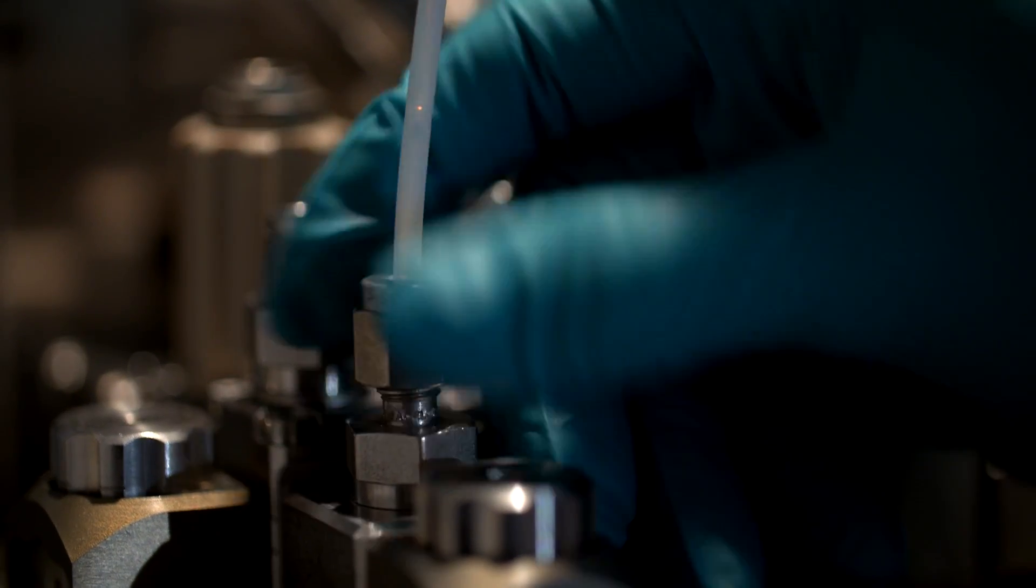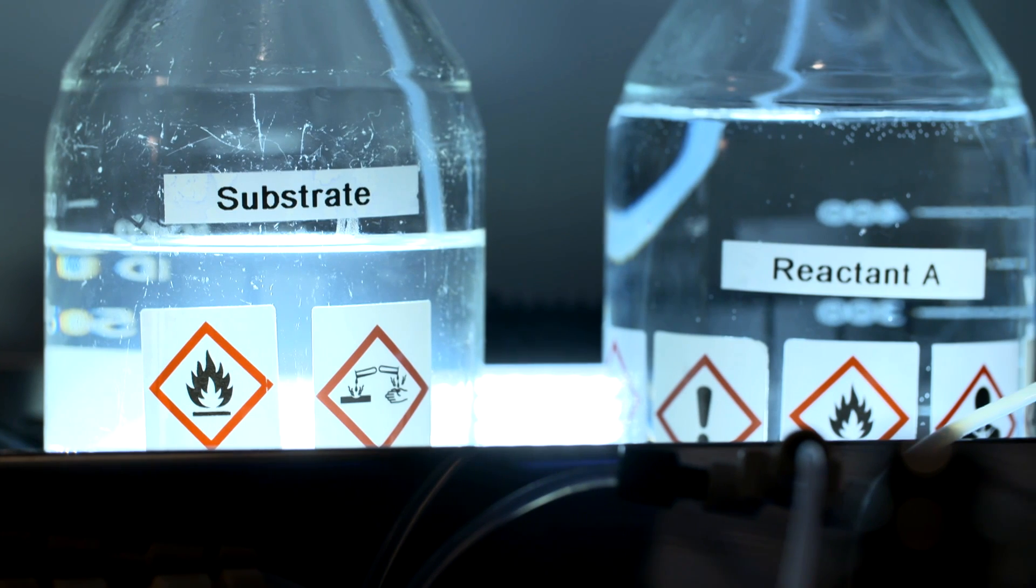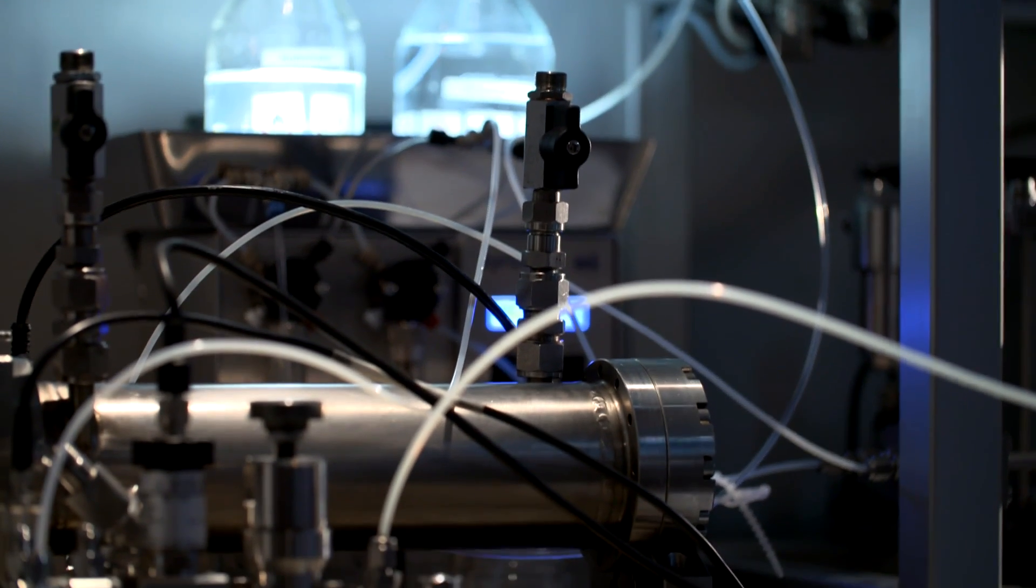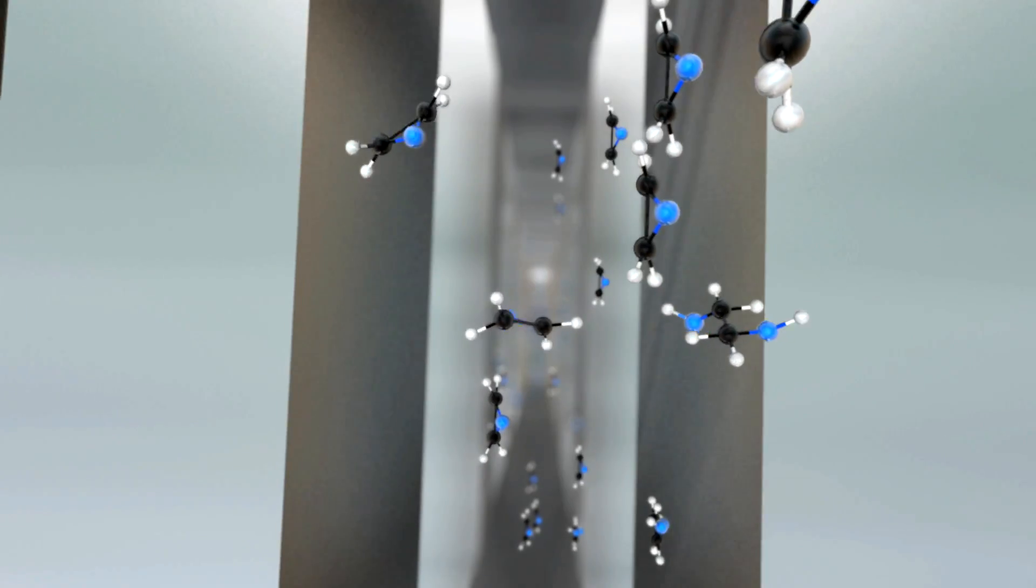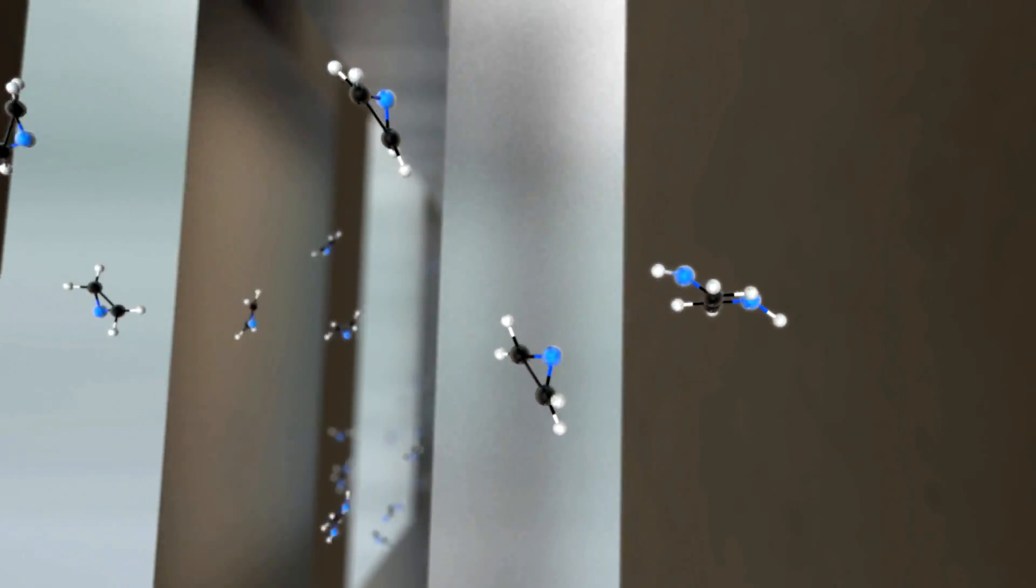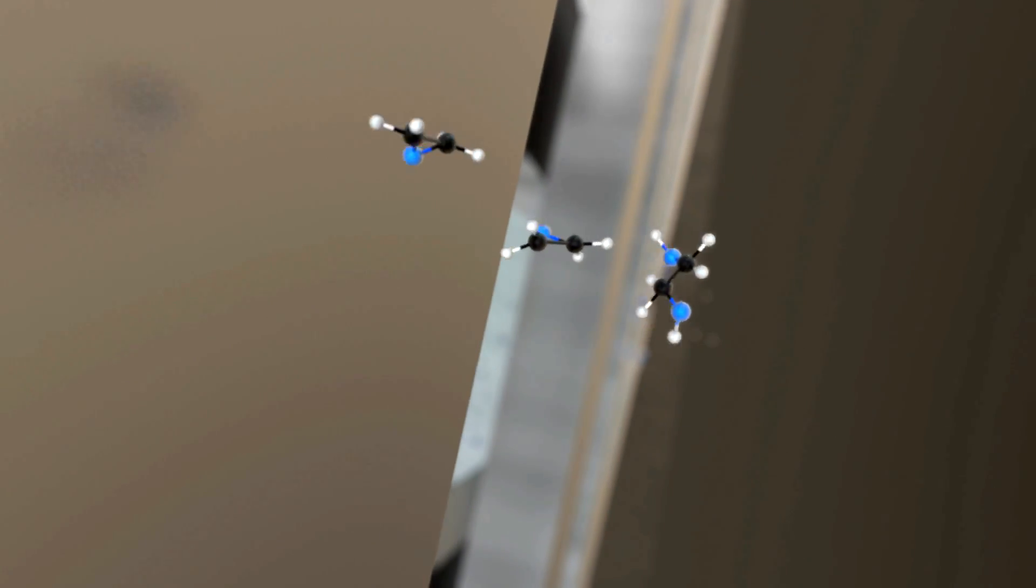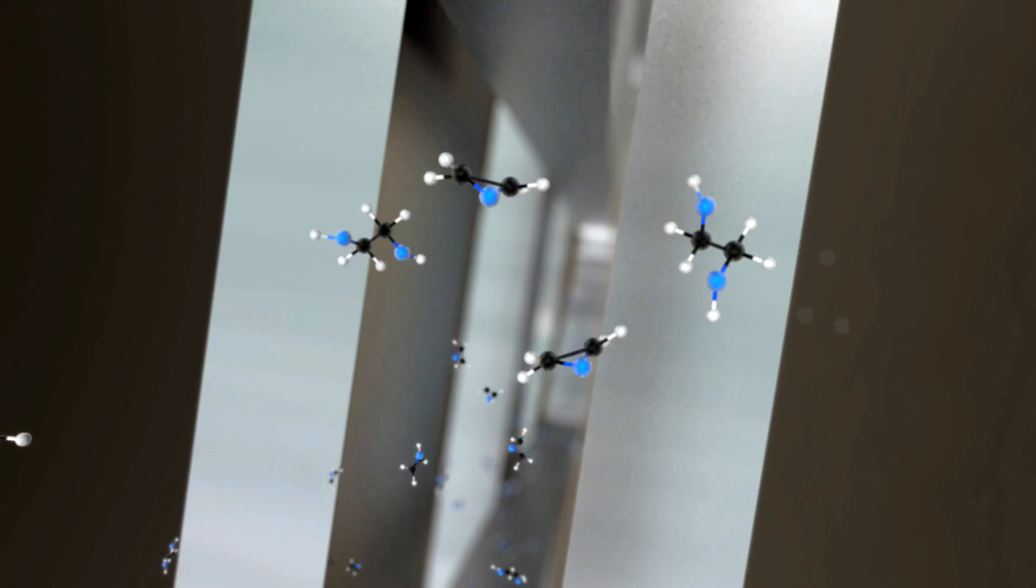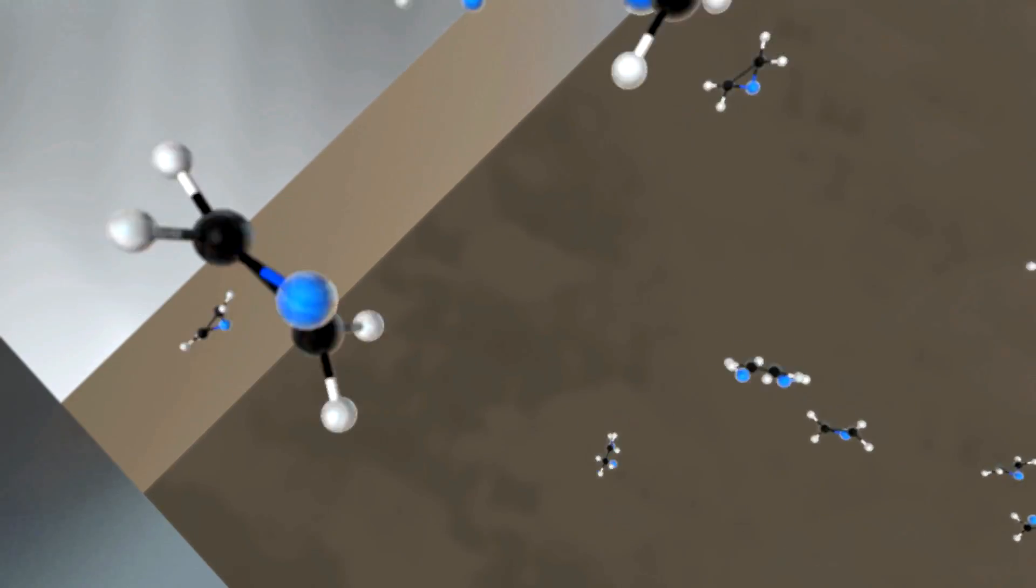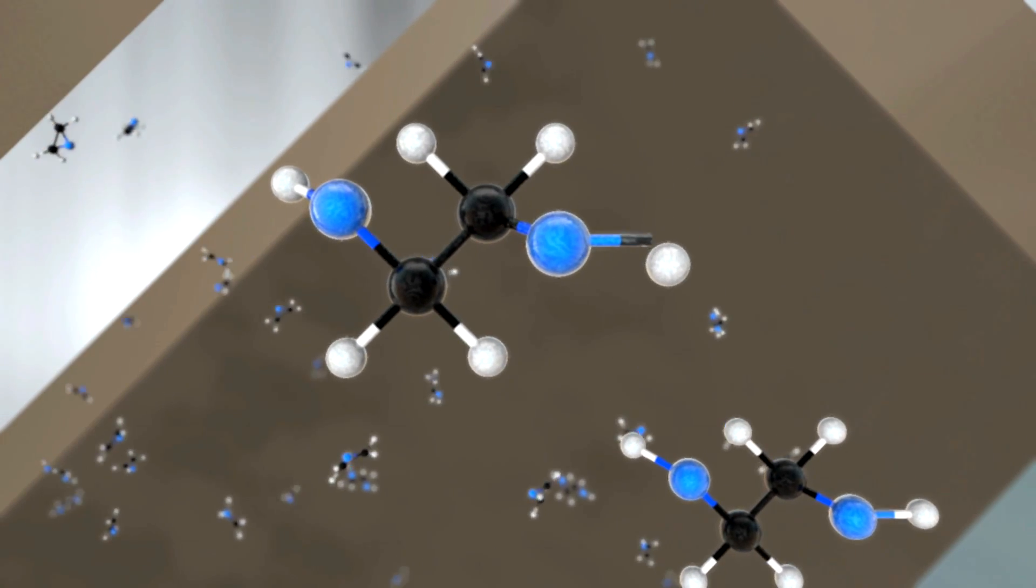This experiment is focused on ethoxylation, a reaction that is commonly used in the production of materials for the cosmetics and paint industries. Manufacturers use toxic and highly flammable ethylene oxide for this purpose. The ethylene oxide flows through the channels together with another reagent, a type of alcohol. The complex grid structure ensures a thorough cross-mixing of the reagents and leads to an even distribution of reagents in the channel system. As a result, there's no formation of concentration hotspots, and the reaction is controlled.